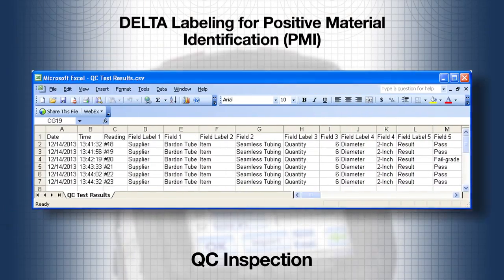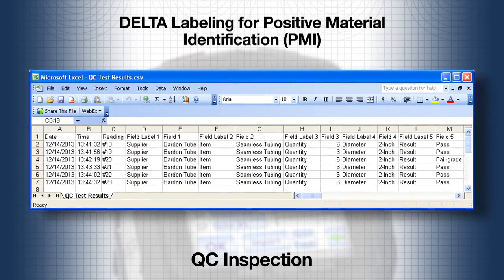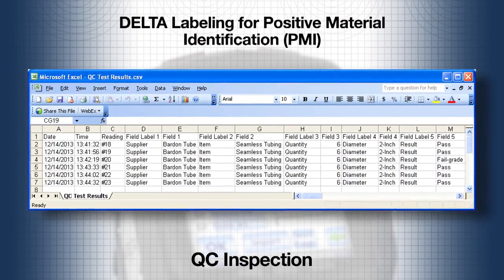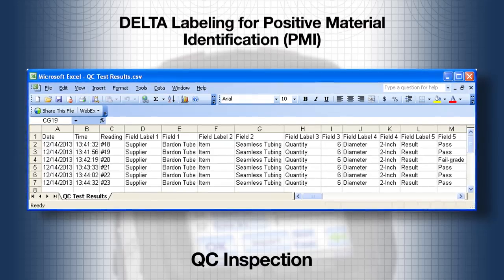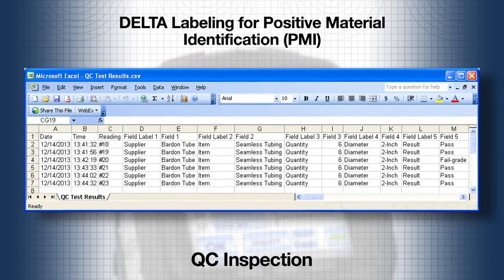The report, which can be used in any PMI software package, will show the labels and results of this testing sequence.